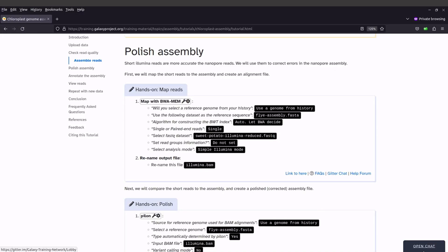So with the polishing, we are going to use three tools. We will use BWA, SAMTOOLS, and Pilon. We will first map the Illumina reads to the assembly, and after that, a BAM file will be generated. This BAM file will be sorted and indexed, and then Pilon will be used to do the polishing. So let's go to the terminal and I'll show you how that is done.